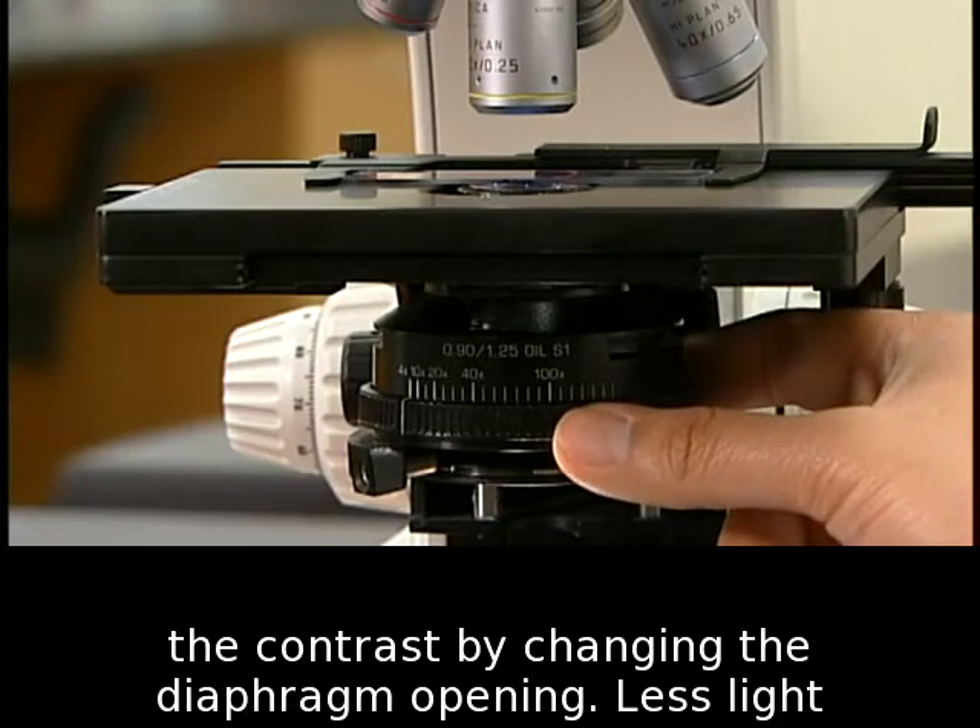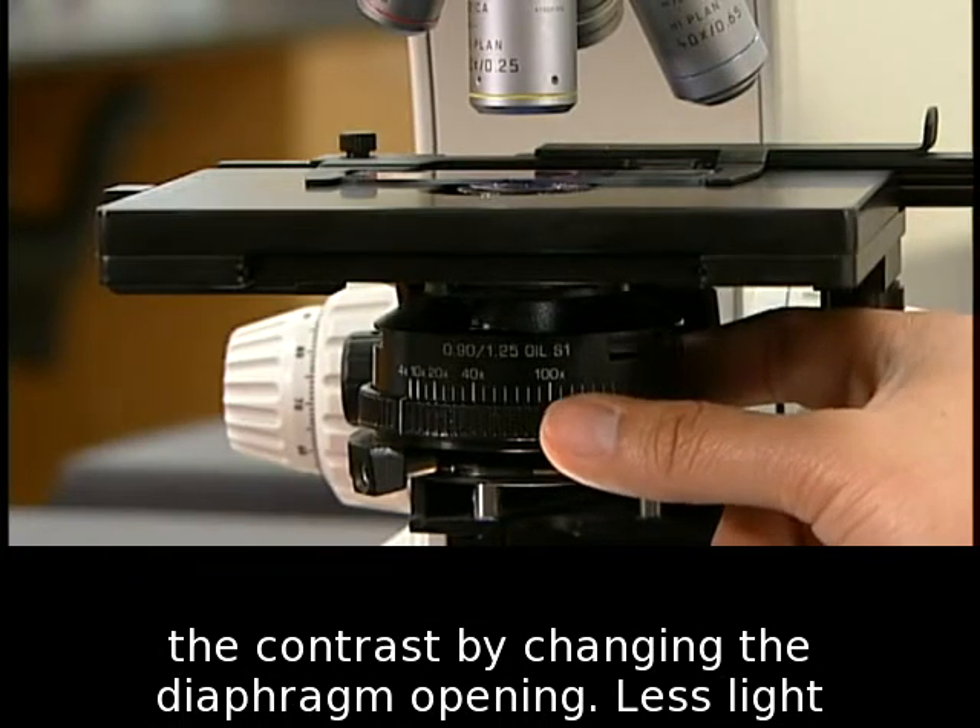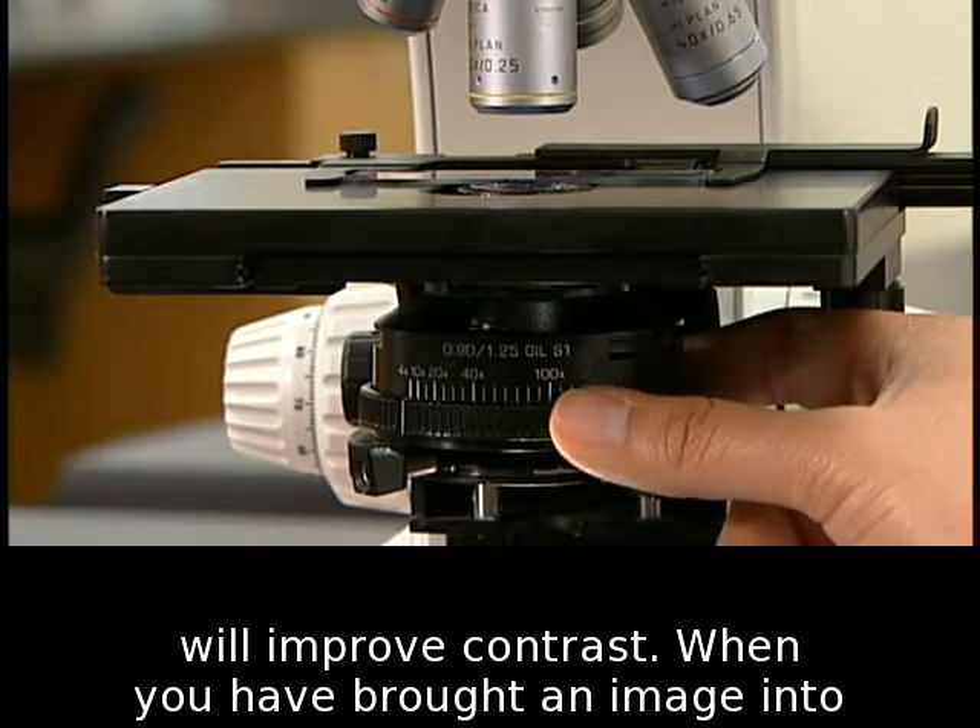Adjust the contrast by changing the diaphragm opening. Less light will improve contrast.